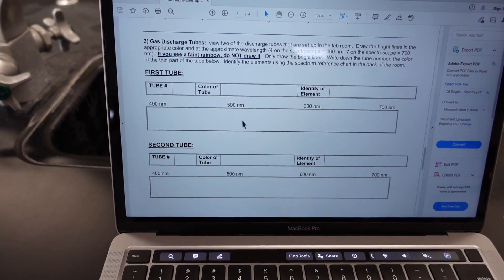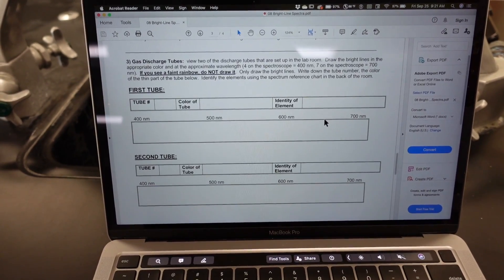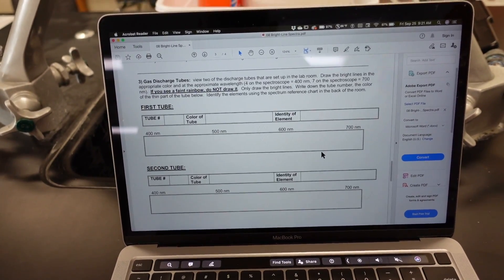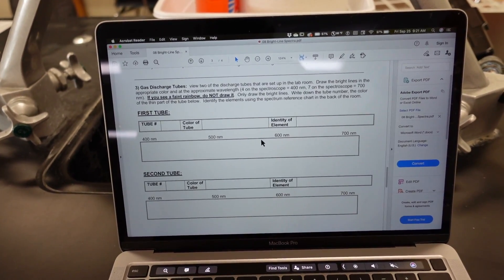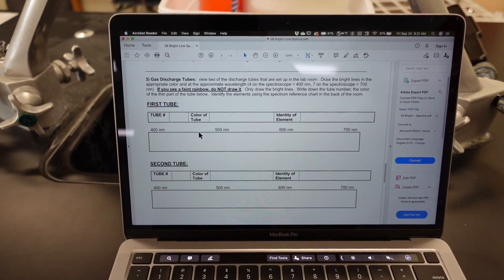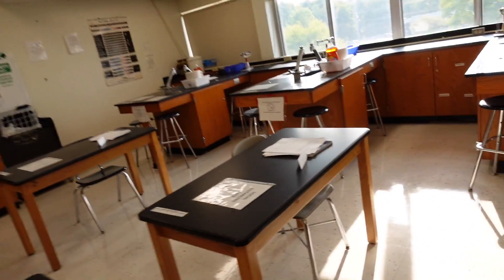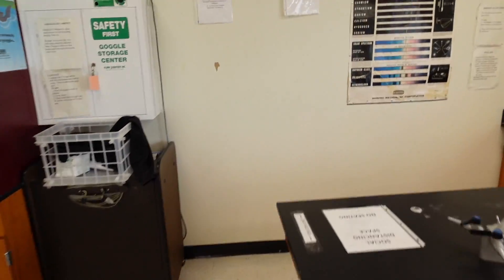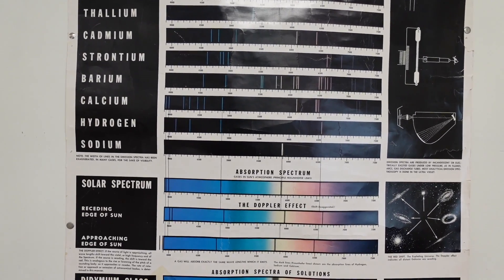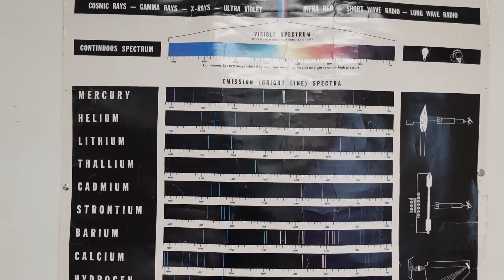After you draw, you're going to identify the element. So let's say you look through the spectrum tube and you see a red line at about 6.5 — then right about here between 600 and 700, you're going to draw a red line. Let's say you see a green line at 5.8 — then at about 580, you'll draw a green line. Let's say you see a violet line at about 460 — then at about 460 right here, draw yourself a purple line. With your color patterns, you'll be provided with a color chart that you can use to identify what element you have. If you have two bright yellow lines and that's all you have, then that means you have sodium. Your bright lines should match as close as possible to these references.